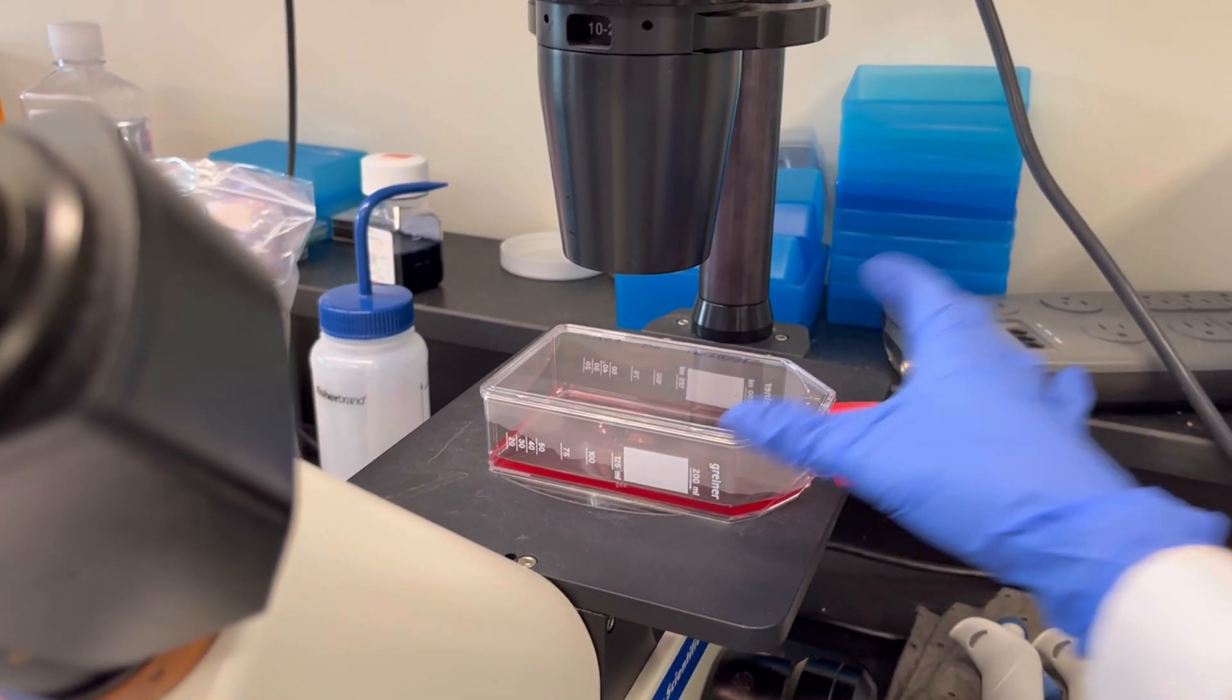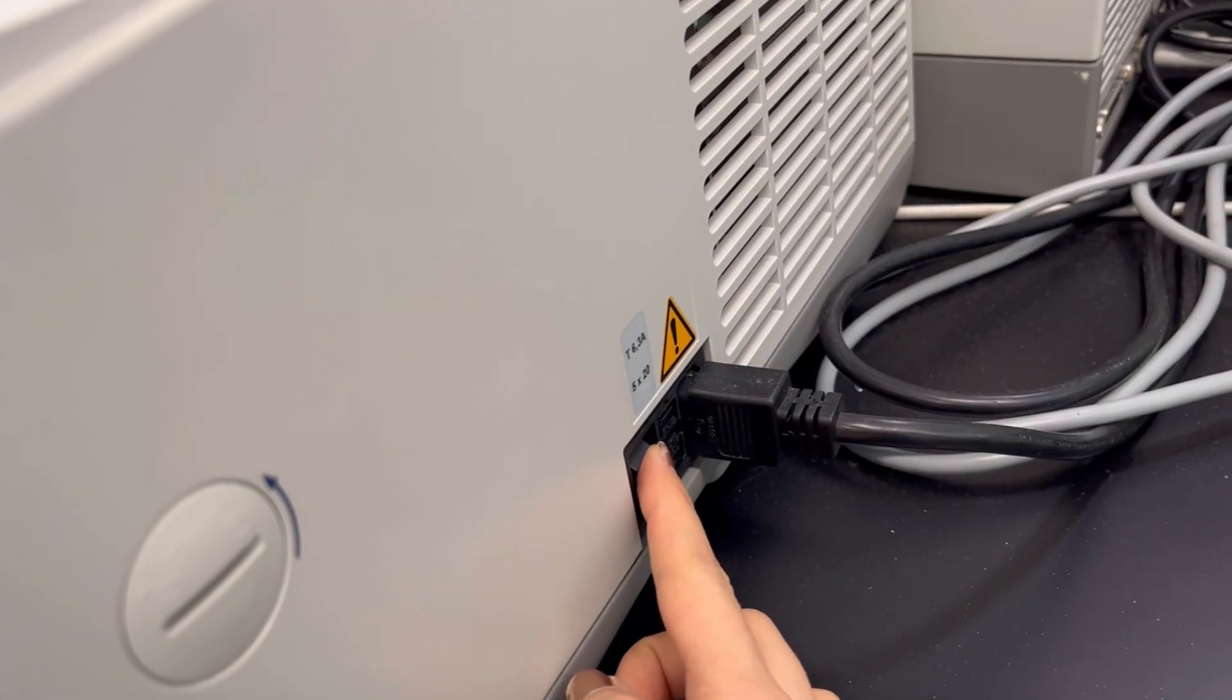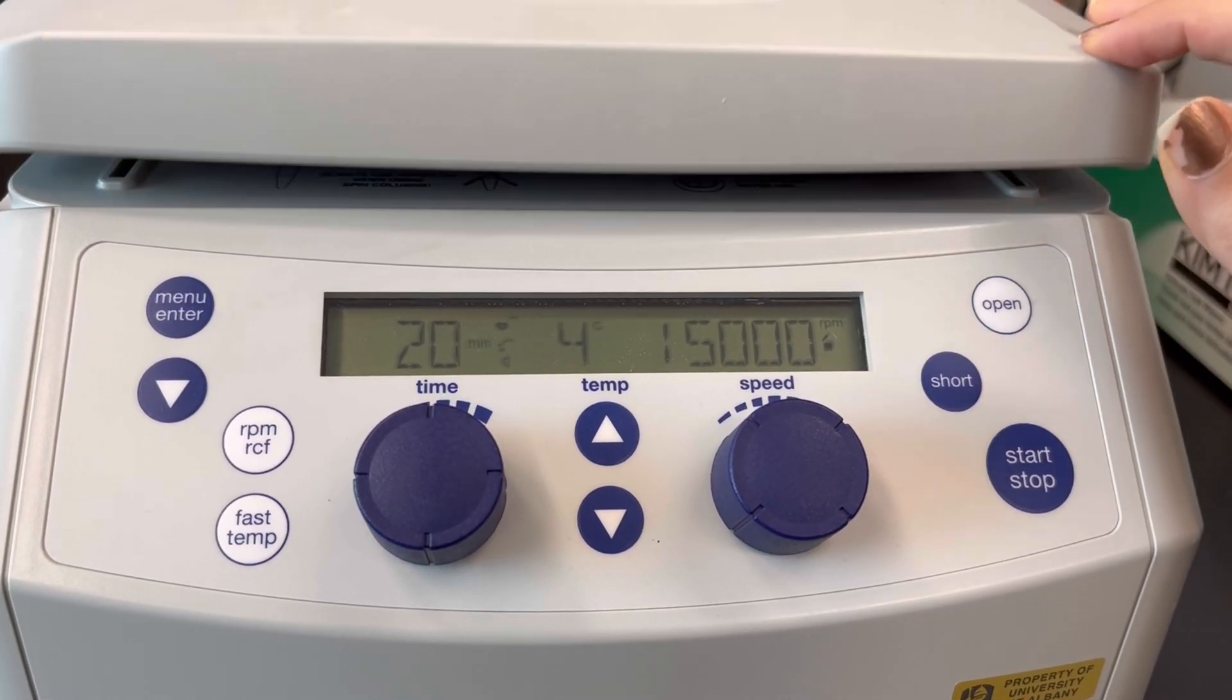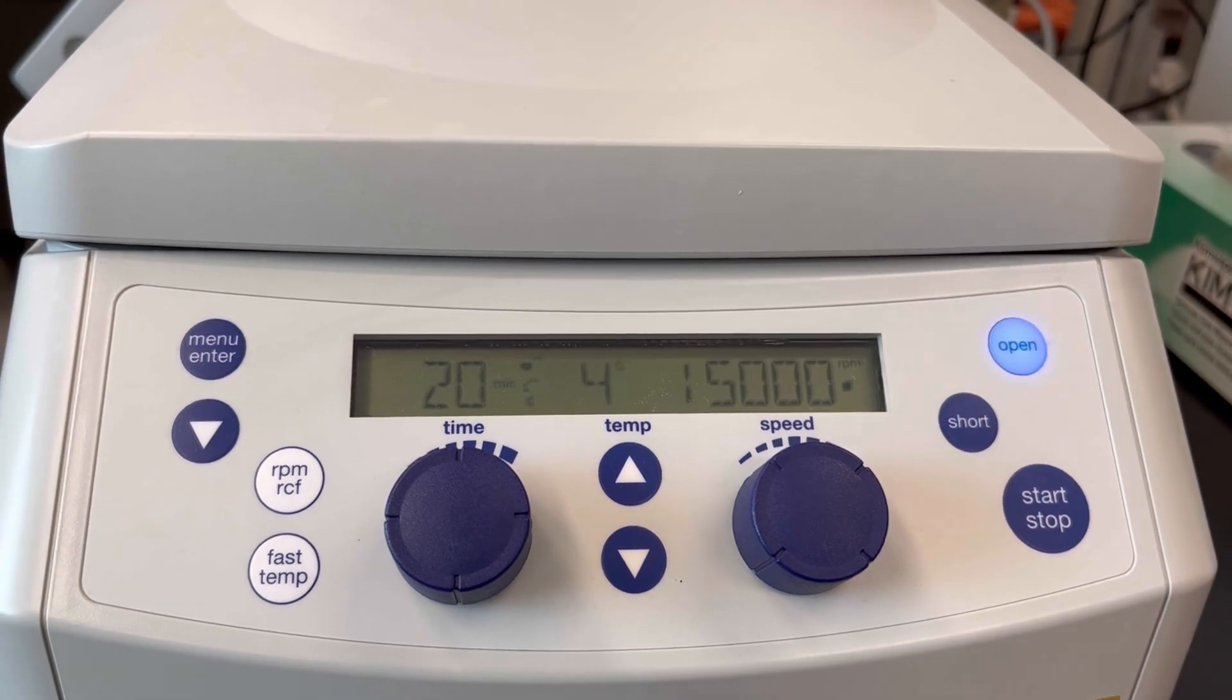Monitor your cells before an experiment to make sure they are healthy. Turn on the centrifuge and set it to 4 degrees Celsius.